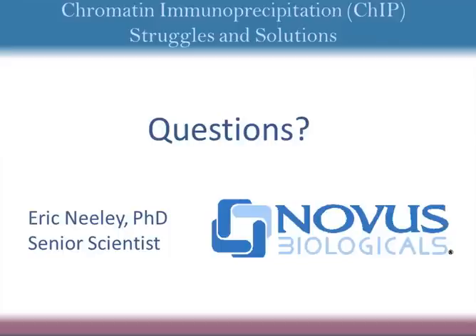Great. Okay, and also on that topic, a couple of people are saying that they don't have access to sonicators, and so they're asking, is there any problem with doing an enzymatic digestion at that step? No, it's just a different approach. It's not a problem. It's just more, what do you want?